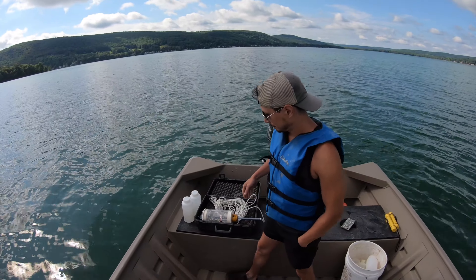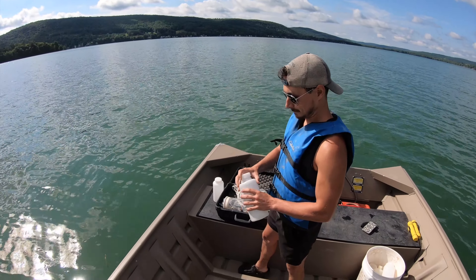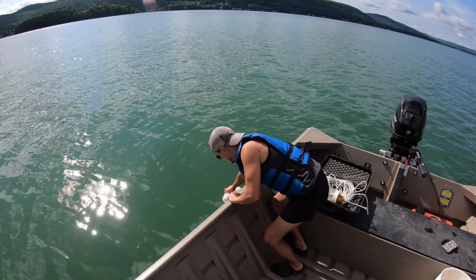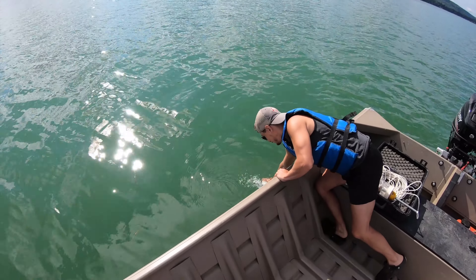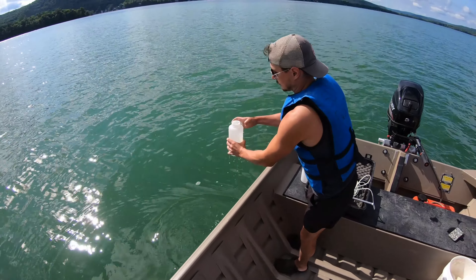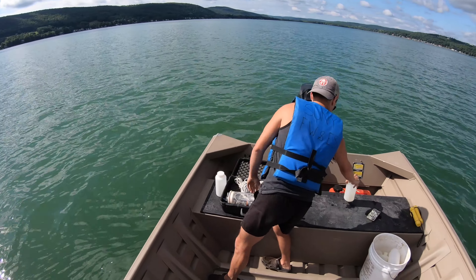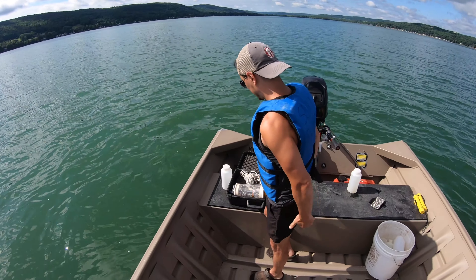First off, we're going to have Matt grab a sample jar and take a sample of surface water. He's just going to put the jar right over the side of the boat, get it all nice and filled at the top. We're going to put that aside until later. We won't be doing any of this lab work until everyone's back on campus.